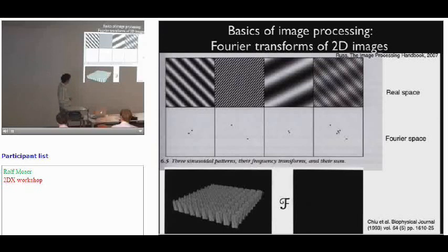You have a two-dimensional array with defined translation in one plane of molecules, and if you compute the Fourier spectrum, you would see a diffraction pattern, which you do not see in this case, but you can be certain. So this corresponds to several spots.